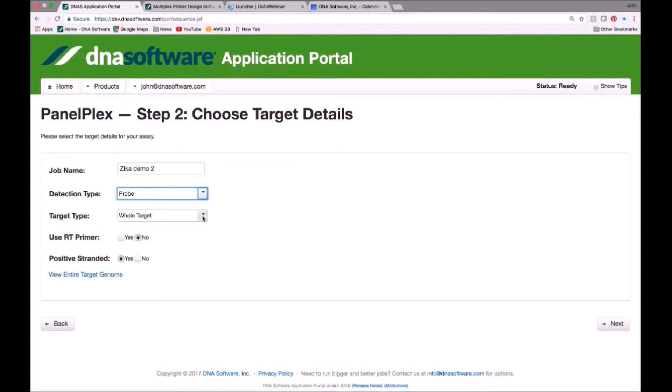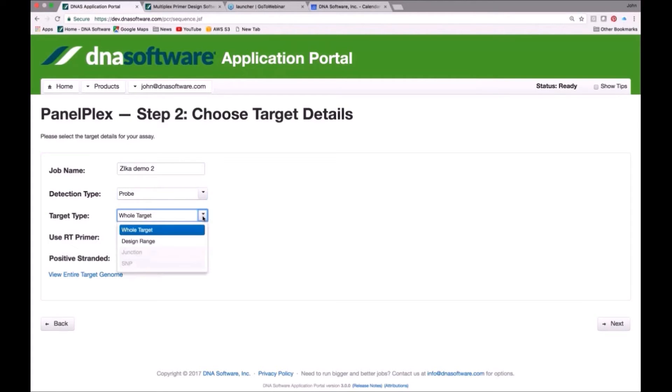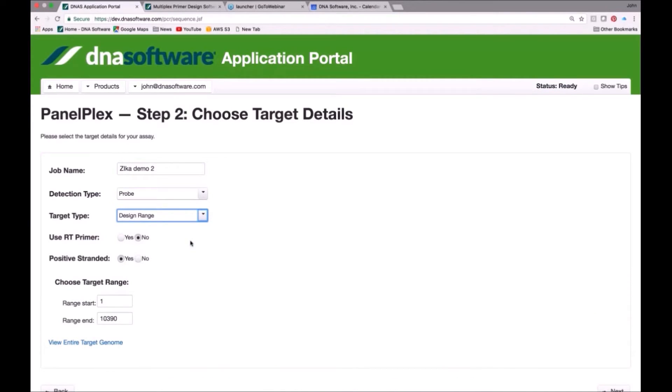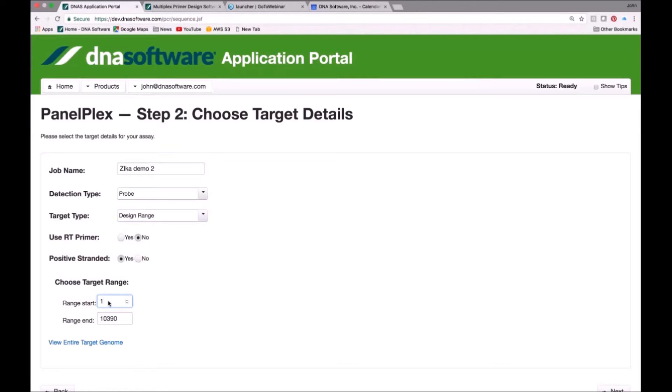Now the next option is, do you want to detect the whole target, in which case the software will check the entire Zika virus, which is over 10,000 nucleotides length, and it will try to find the best places for design. Or we can choose a design range. We allow design ranges up to 40,000 nucleotides. In this case, the Zika virus is 10,000 nucleotides. We could say, please direct our design to, maybe we know where there's a gene. Maybe it goes from 5,000 nucleotides, 1,500 to nucleotides, 2,500. It would limit the design to that region if you did that.